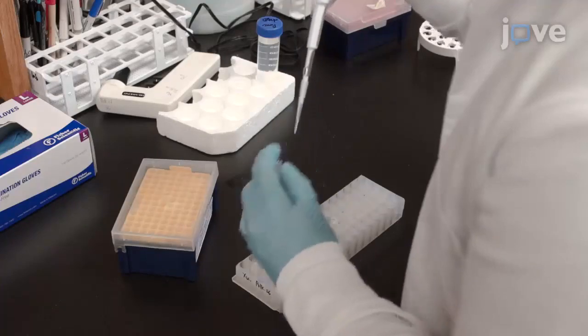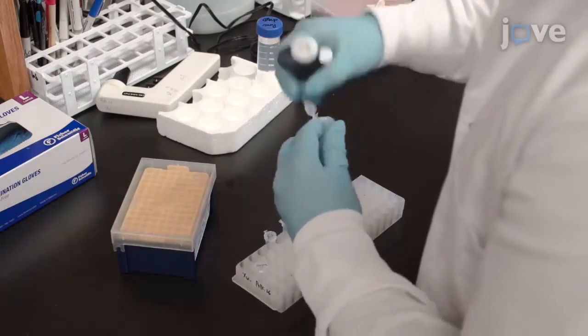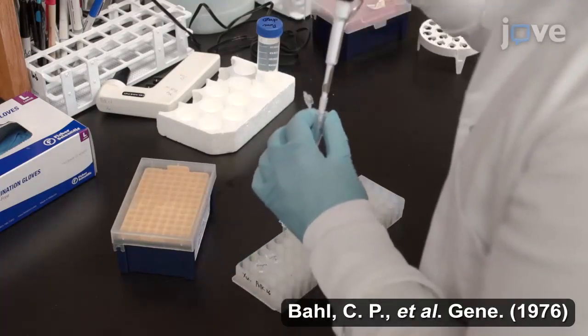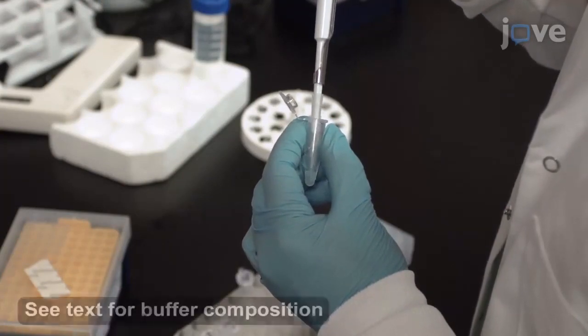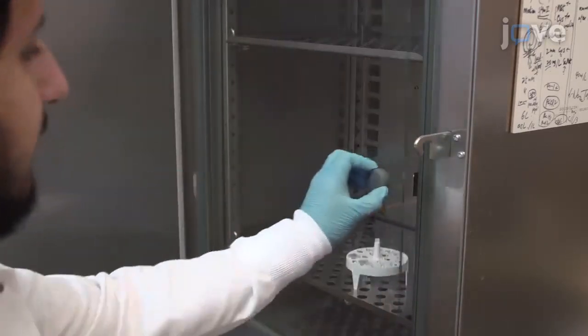Next, digest 4 micrograms of the DNA with BGL2 and X1, and 4 micrograms of an expression vector DNA with BAMH1 and X1. Mix 10 units of each restriction enzyme with the DNA in a 1X concentration reaction buffer. Incubate at 37 degrees Celsius for 4 hours.